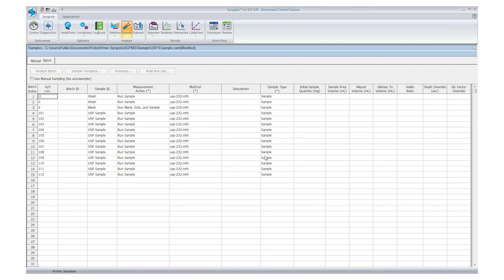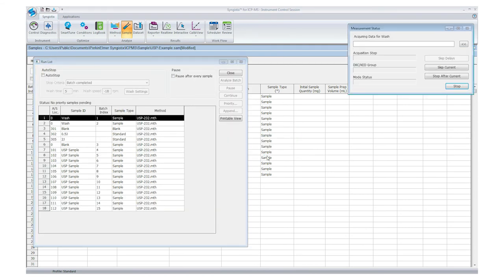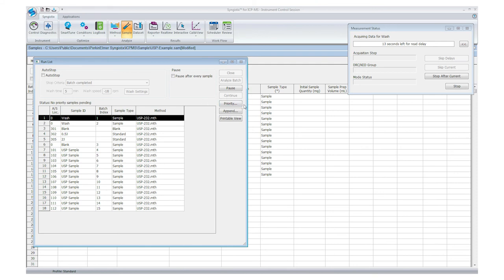If a priority sample comes in during your analysis, you can always add it to the run by clicking on the priority button. This will ensure that the sample is run next. You can also add additional samples to the run by using the append button.